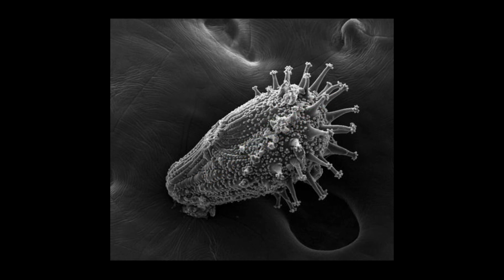We then have a photomicrograph using a scanning electron microscope. The SEM produces a three-dimensional image where all parts are in focus. This is because the image is produced by electrons on a screen and not our eyes, that can only focus on a certain depth or dimension at a time.